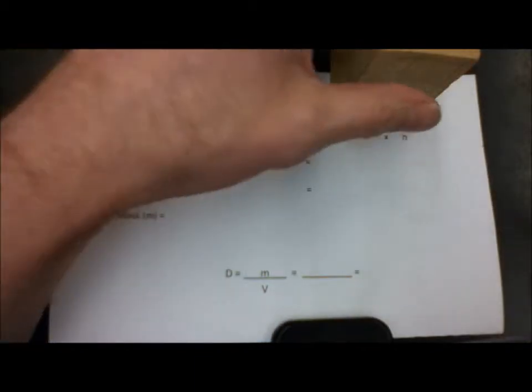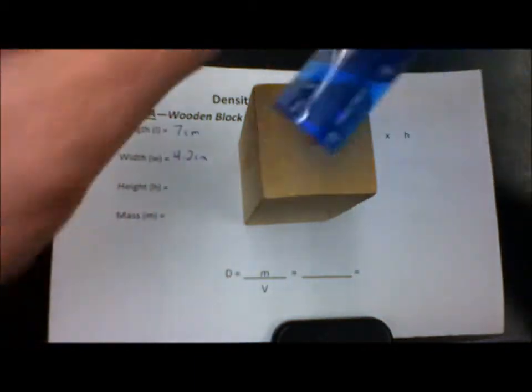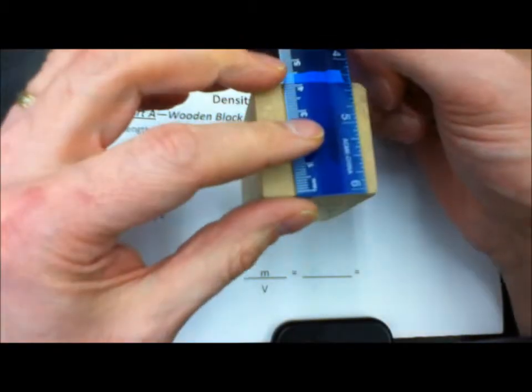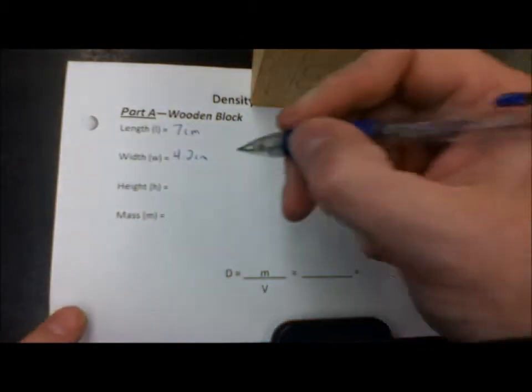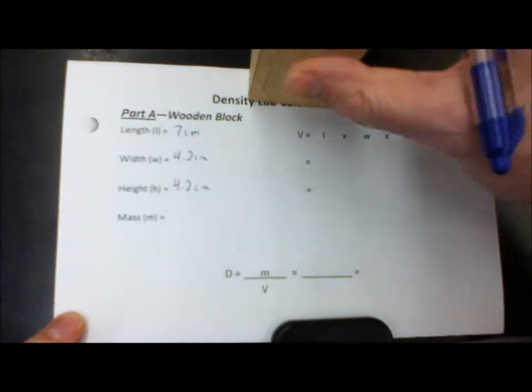And of course, the height is probably going to be something similar considering this is square at the end. And yeah, it's going to be 4.2 centimeters in height as well.